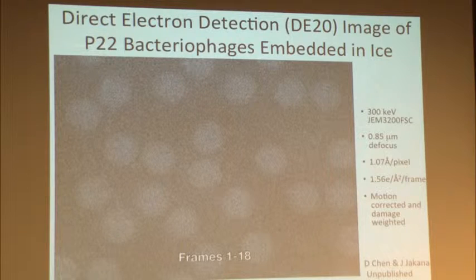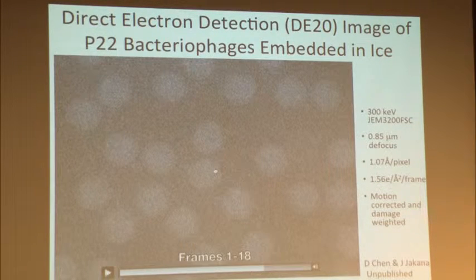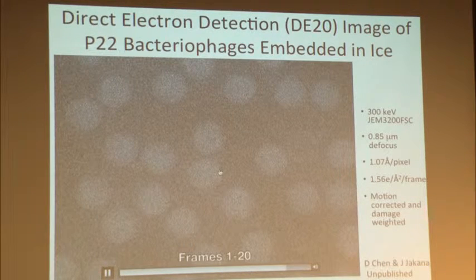We can measure the information content by doing a Fourier transform. We can evaluate in either real space or Fourier space. And so these are the images we are getting from these types of electron detectors.